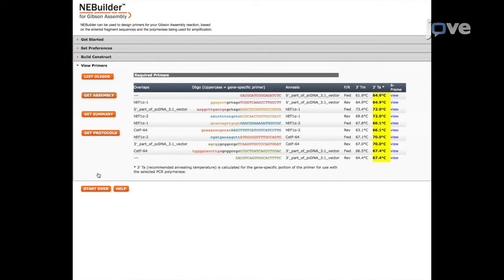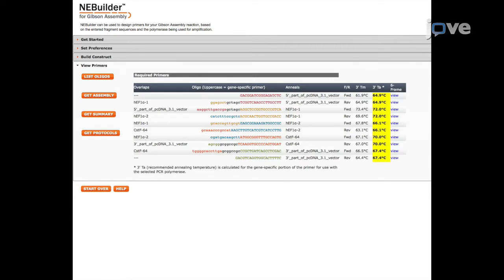Select the View Primers menu and review the primer sequences. Also repeat for all constructs, vector backbones and inserts, or for DNA fragments that are different.